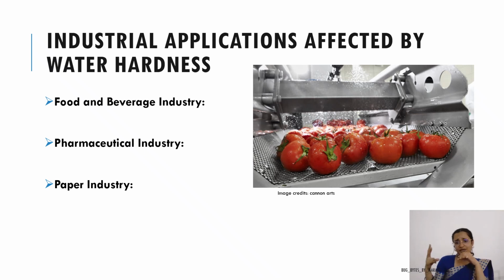If we speak about the pharmaceutical industry, it requires soft water for the formulation to avoid contamination and to meet specifications. So to avoid these problems, we use soft water. So it is compulsory to estimate the hardness of water.